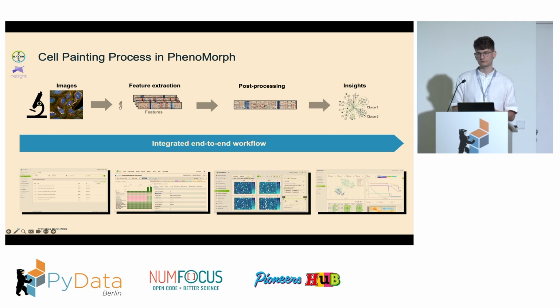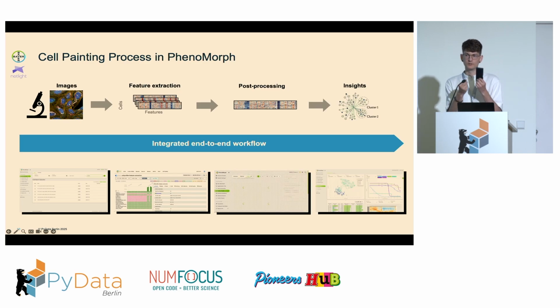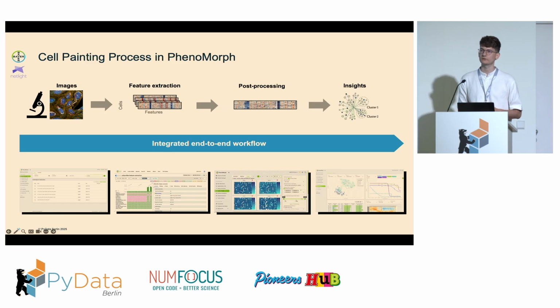Here, in a bit of a fast forward, you see on the first image on the left-hand side how images are imported into our platform from the raw microscope data. Then you see an Airflow UI, with which our platform allows you to orchestrate and see the status of Airflow pipelines. And then in a continuous process, it might be that, for example, there is a bit of dust on the head of the microscope camera, or through outside factors like temperature or humidity, some of the images are just invalid.